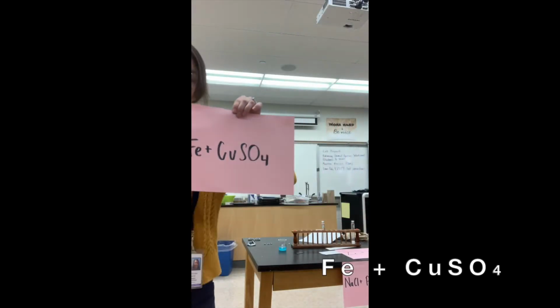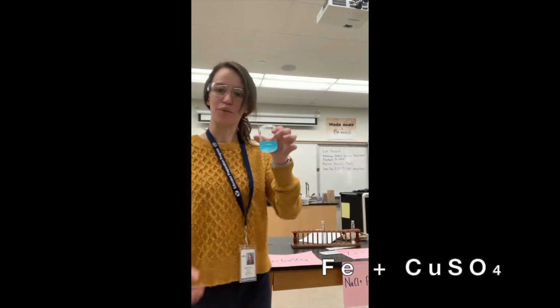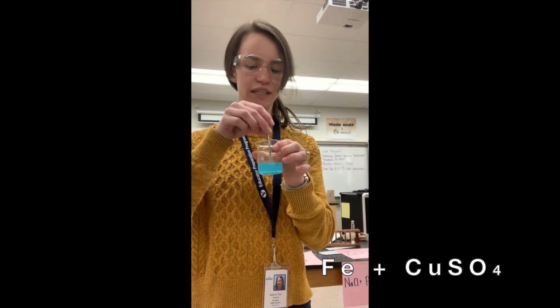All right, so we're doing Fe plus CuSO4 for this one. And so I have here, it's CuSO4, it's a blue liquid, and we're gonna put iron in there. We're just gonna use a nail and we're gonna see what happens after about 20 to 30 seconds.